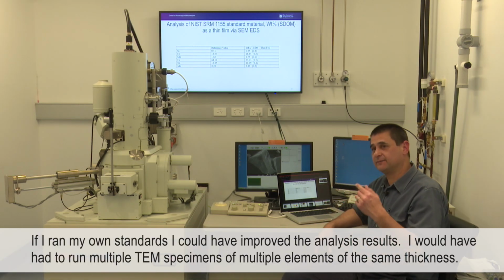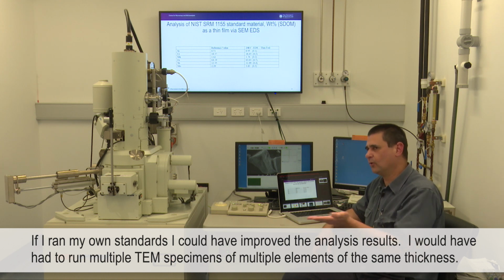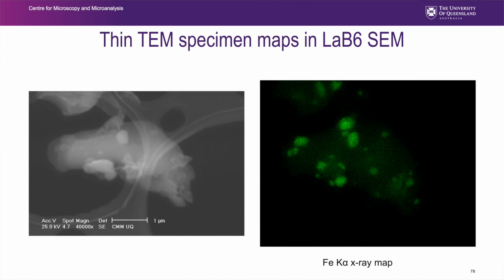But then I would have had to make multiple TEM specimens of multiple different elements and try to make sure that they were all the same thickness. You can do it. It's a difficult and long-winded process. And this is something I did a long, long time ago on what is now considered an ancient machine that doesn't even exist in the lab, a LaB6 SEM. So you can certainly do a lot better now on a modern field emission SEM.